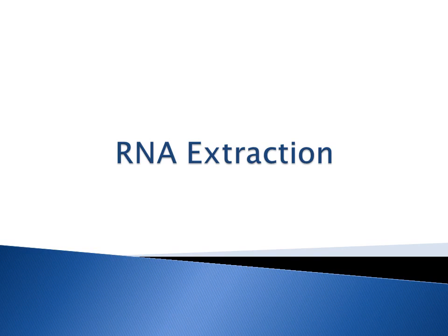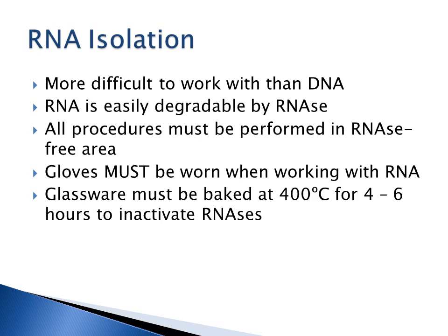So let's talk about RNA. The previous section concentrated more on DNA, so let's focus on RNA extraction. The RNA extraction methodologies are very similar to DNA extraction. The main thing with RNA isolation is RNA is much more difficult to work with than DNA.